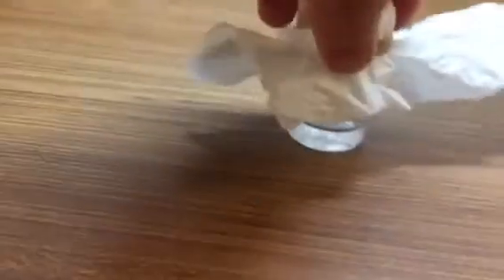No, that's not happening, because there are many. You see that? Yeah, many small crystals. I see a large one there, but that's not happening here. They're all evenly distributed.